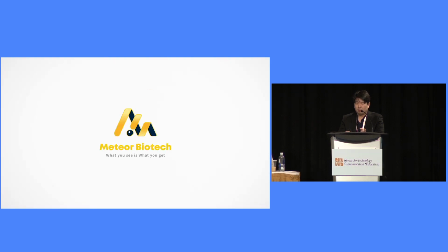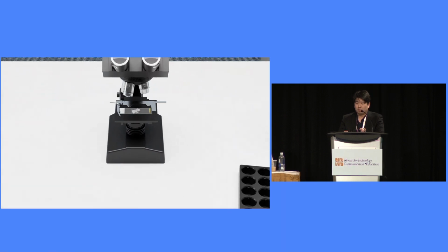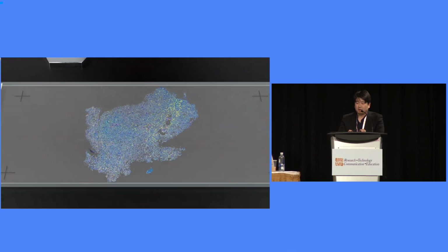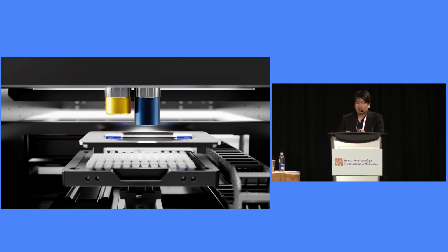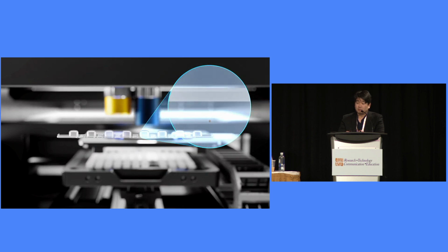Also, the core principle behind this workflow is that if you have any kind of tissue or biospecimen that could be prepared on top of a slide, you could image it and look for where you want to isolate, and then we can target that cell. You can then get the deepest information from these cells using whole genome sequencing, whole transcriptome sequencing, proteomics using mass spec, or any other technologies that you can do with PCR tubes.